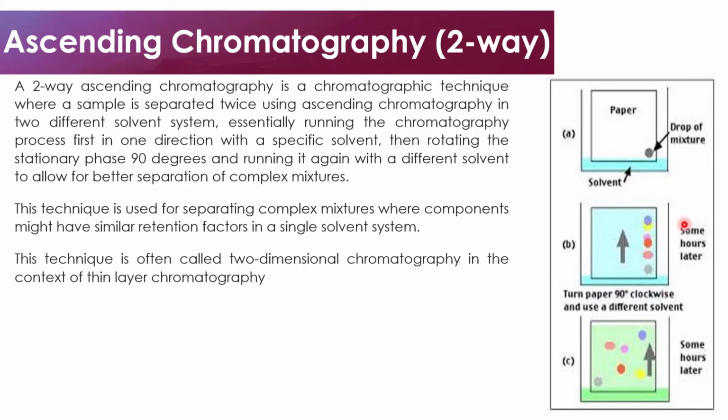So I'm going to use this picture over here to explain to you how the two-way ascending chromatography works.